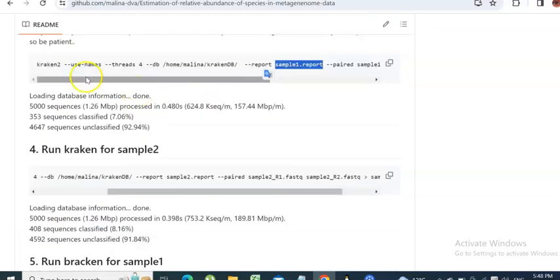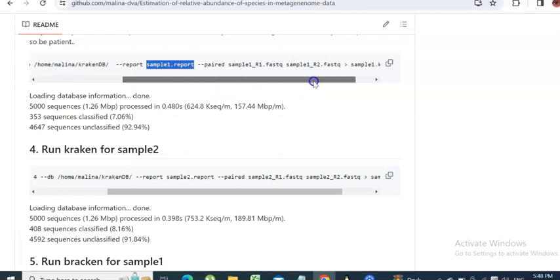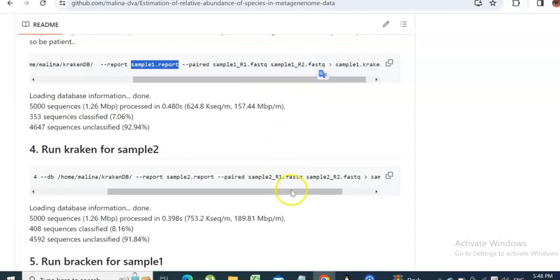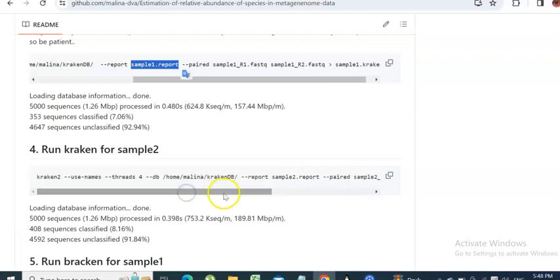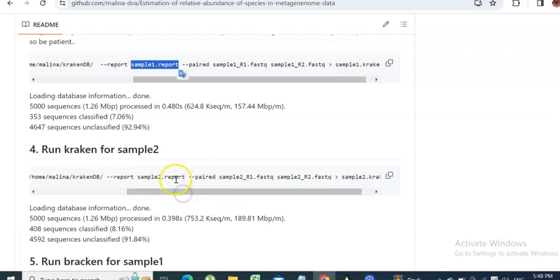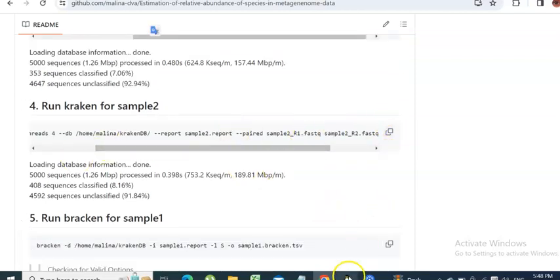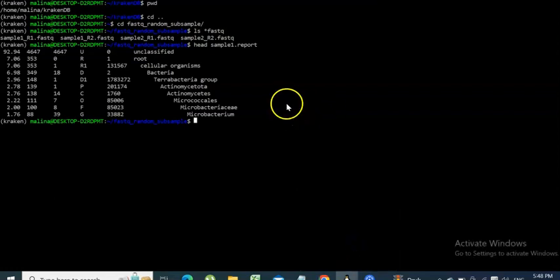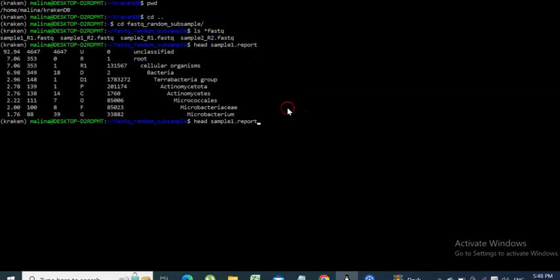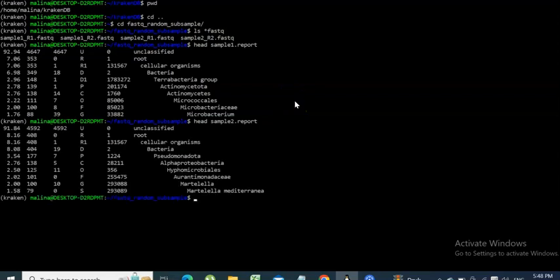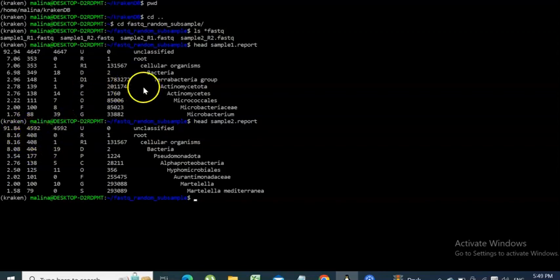We need to run the Kraken 2 command that we just ran for the FASTQ paired entries for sample one, also for sample two in exactly the same way. We will get a sample two report respectively. Just copy this command, go back to your Linux terminal and execute it. Let's have a quick look at what the sample two Kraken report contains.